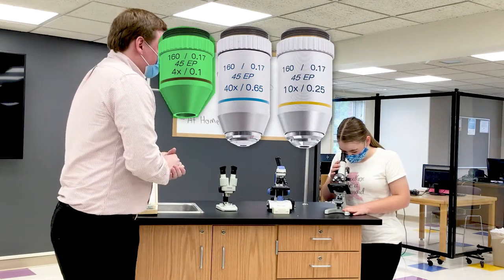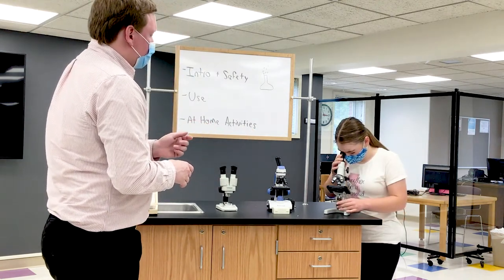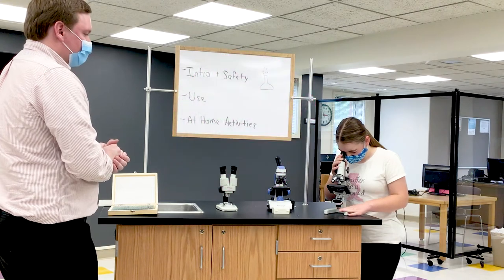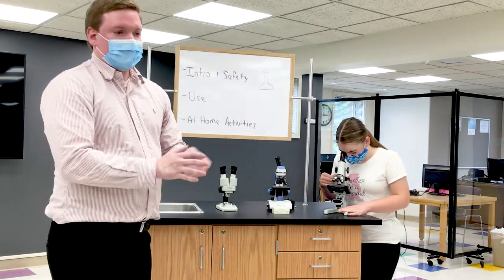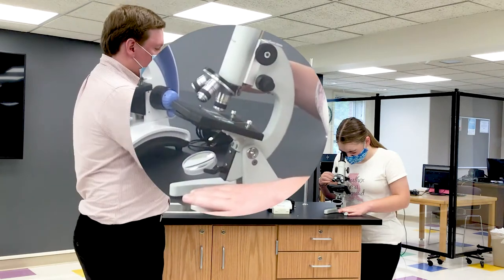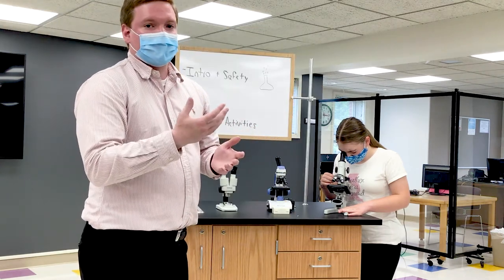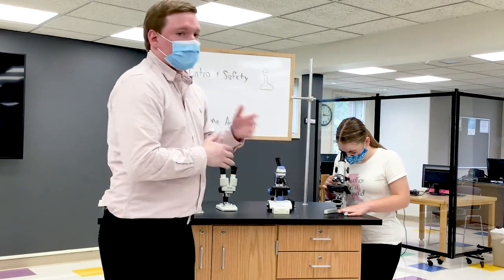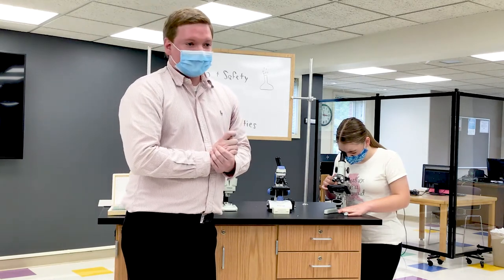Starting on the lowest objective — and be sure that if it's completely black, you can use the mirror on the bottom so that you're able to get as much light as possible. Yeah, there you go. It's very pink. When you think you may have it in focus, you can actually increase the objective when you're ready. Now she's going up in magnification. This will appear a lot closer to you. Now, notice how she's only using the fine adjustment, not the coarse. If you use the coarse adjustment at these later stages with these larger lenses, you'll run the risk of actually making contact with the lens itself with the slide, and that could lead to damaging the slide, could break the slide, and it could also scratch or damage the lens itself, which is a very expensive mishap.